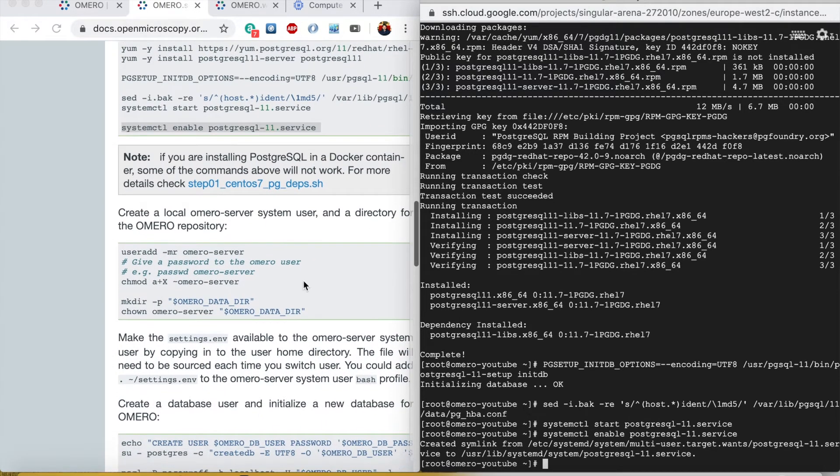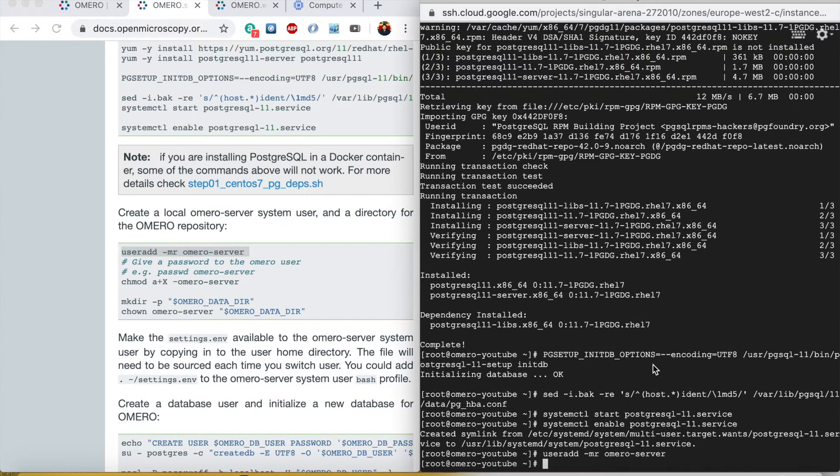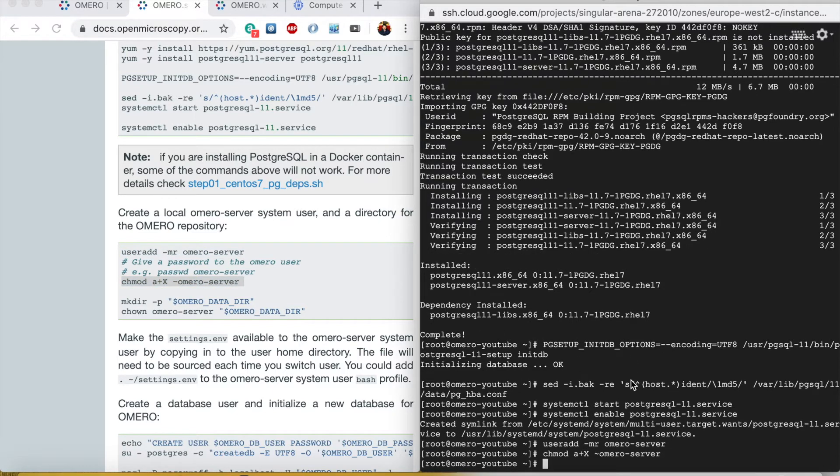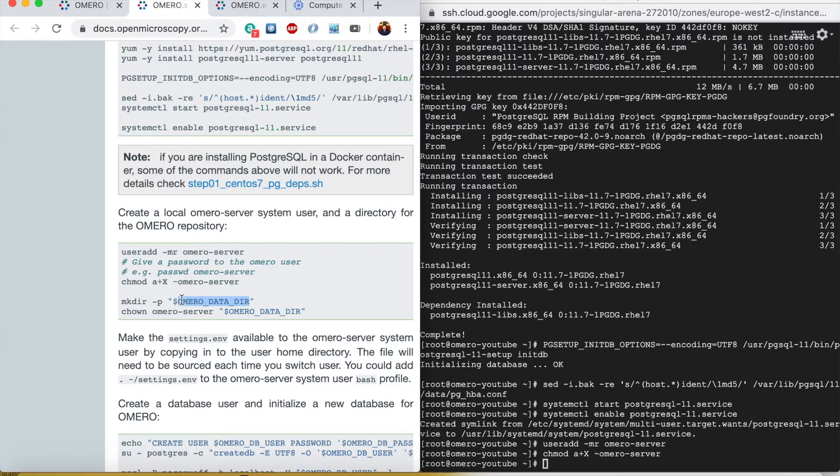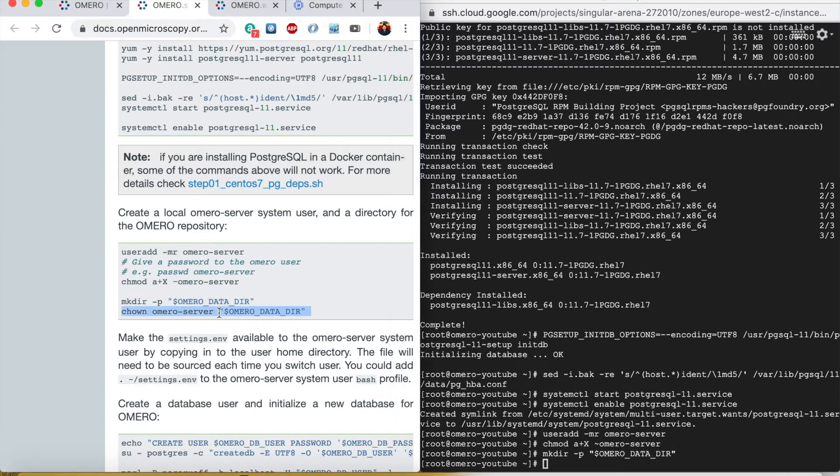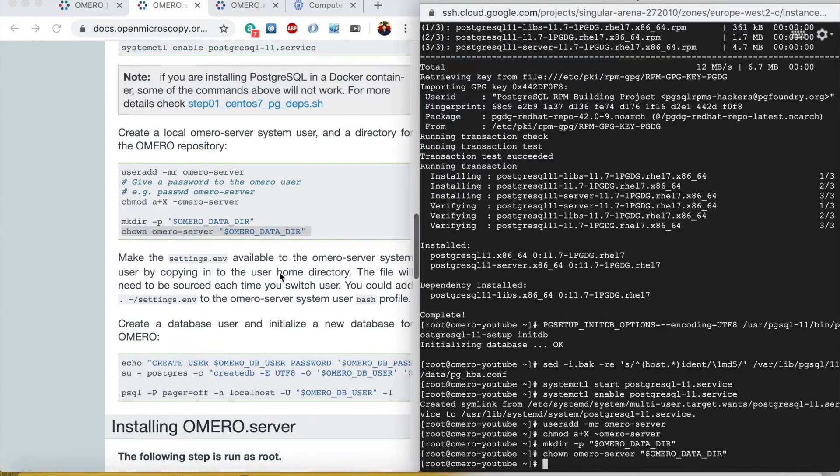Now we need to create the OMERO server user. I will paste this command to give executable permission, give this command to make the directory, and then to change the ownership of that directory I will use this command.